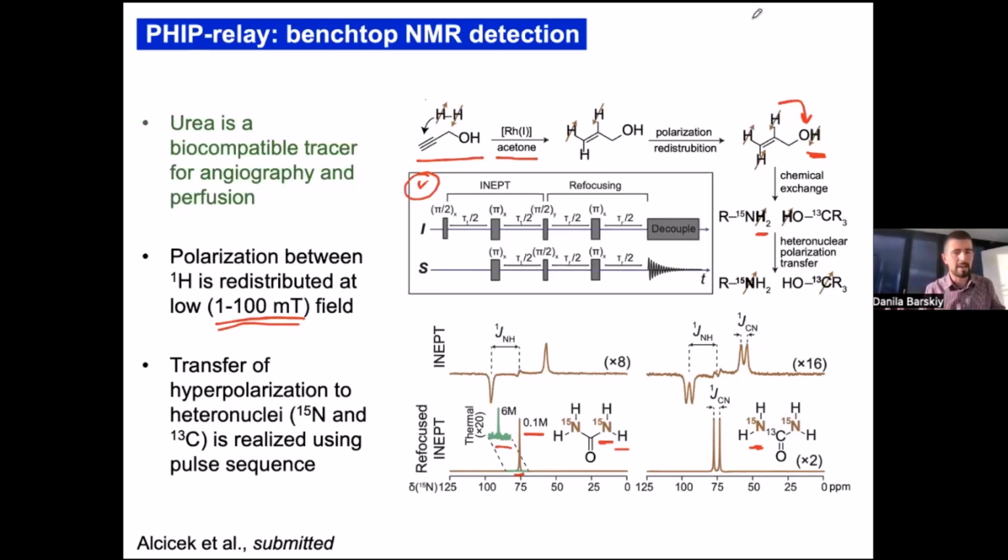And usually in science, when our goal as scientists is to publish, to write papers, we're not always focusing on finalizing the device. Although, for example, in my opinion, urea could be one of these tracers. And I'm not even saying that this presented methodology is the final methodology to polarize urea. It's certainly one of them. We can produce already more than 1% polarization. So I think it's worth optimizing, going towards more reactor setups where we do reactions in more violent conditions in terms of parahydrogen bubbling, for example, compared to what we do in NMR tubes. So it's all about engineering.